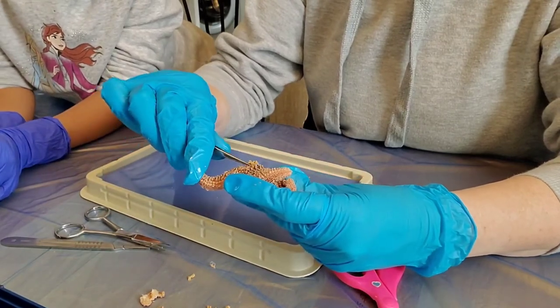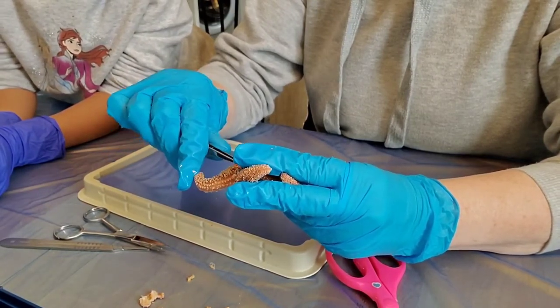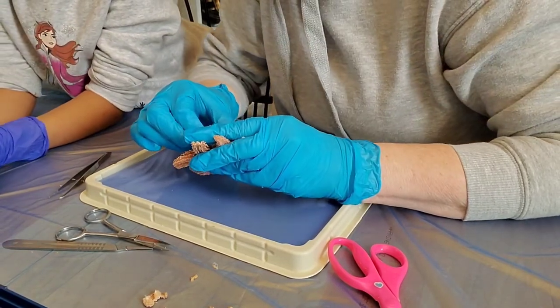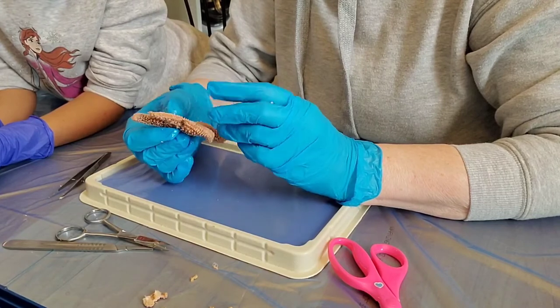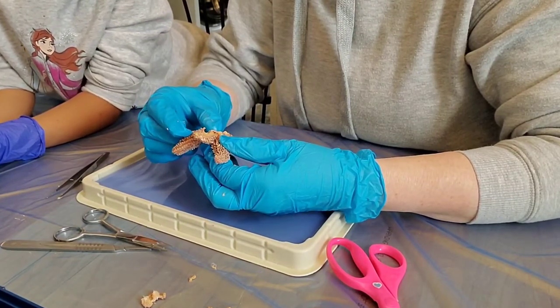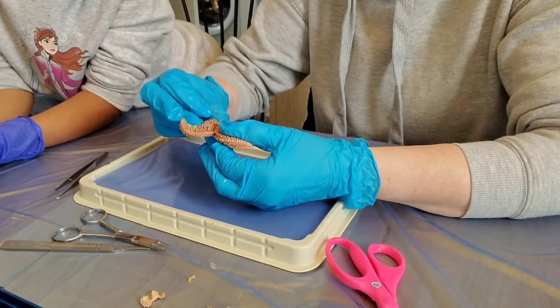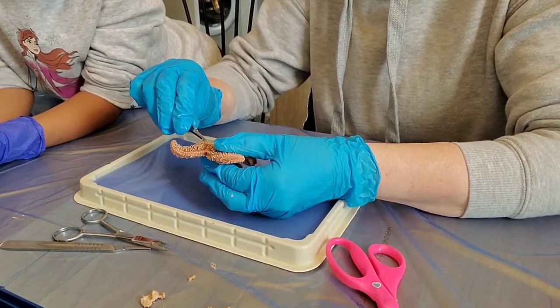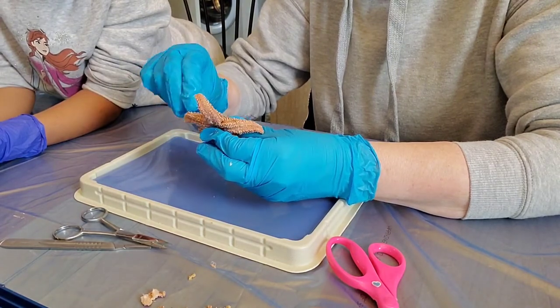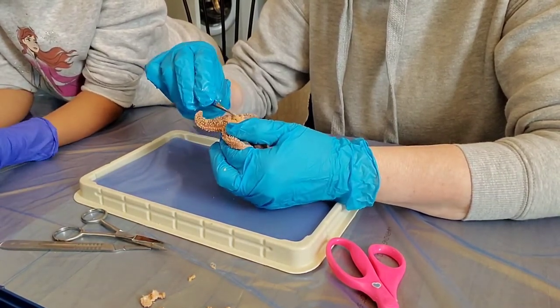Remember the sieve plate? Find it on your specimen again. Look for the thin tube-like organ attached to it — this organ is called the stone canal, and it connects to another organ called the ring canal. The radial canals from each ray attach to the ring canal. Rows of tiny bulb-like structures called ampullae come off the radial canal and are attached to the tube feet. The ampullae, ring canal, and radial canal for the ray you cut open should all be visible at this point.